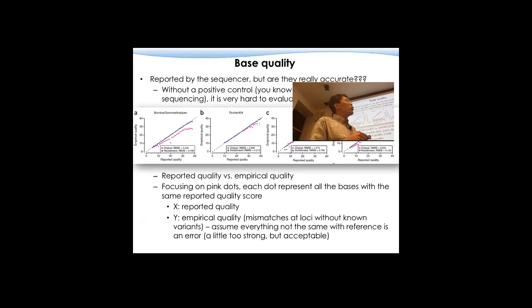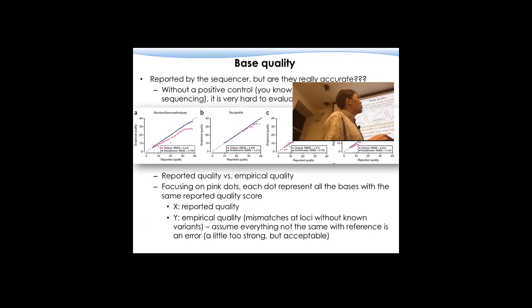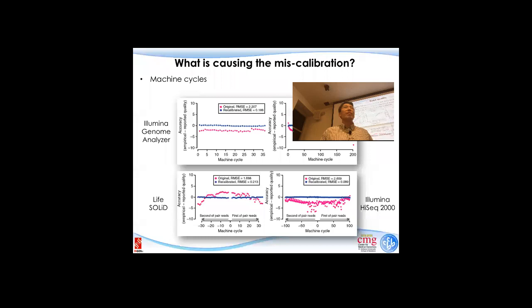Everything is kind of below this 45-degree line. That means the empirical quality is always lower than the reported quality — meaning they're lying. They say they are 0.1% chance of making a mistake, but actually they are 0.5%. So that's the part where we need to do some further investigation. At that time they evaluated several different sequencers — this is pretty early work.